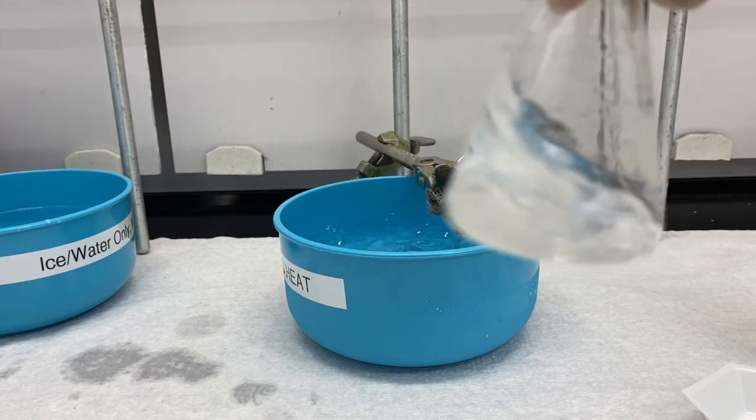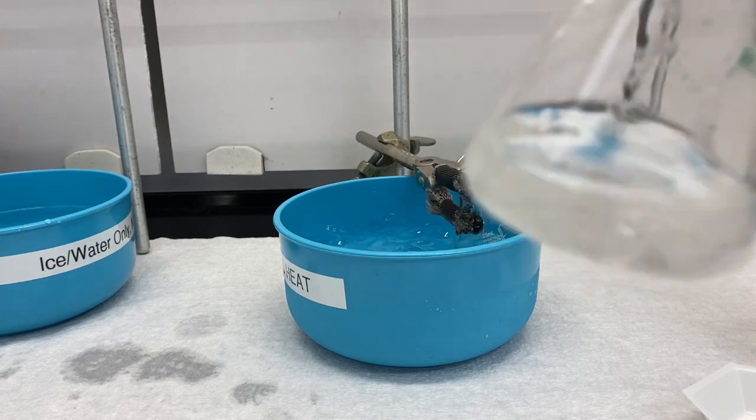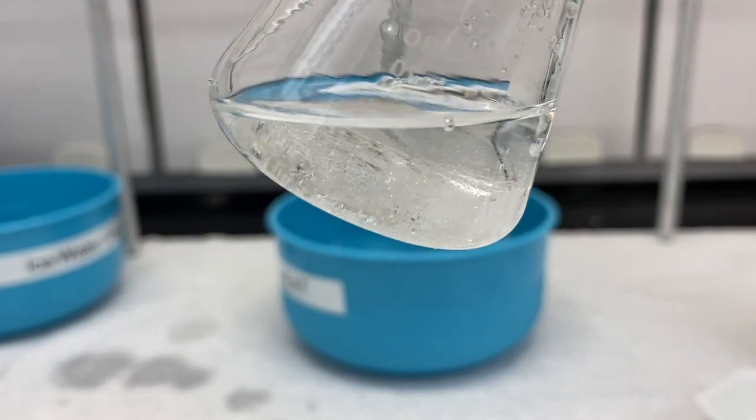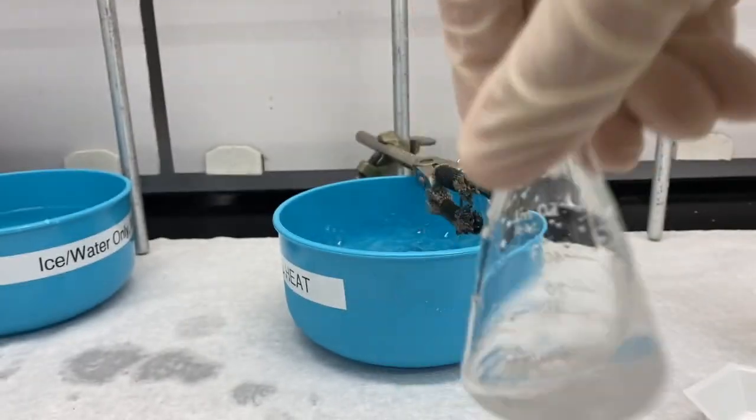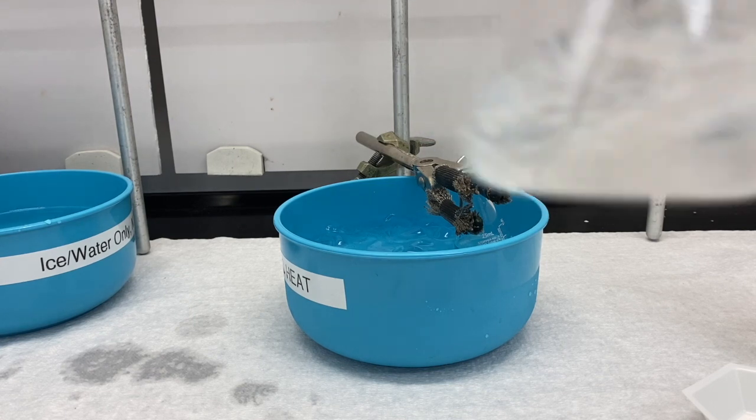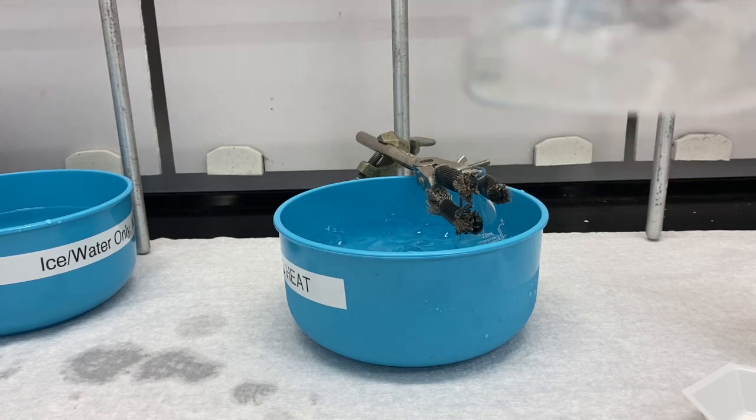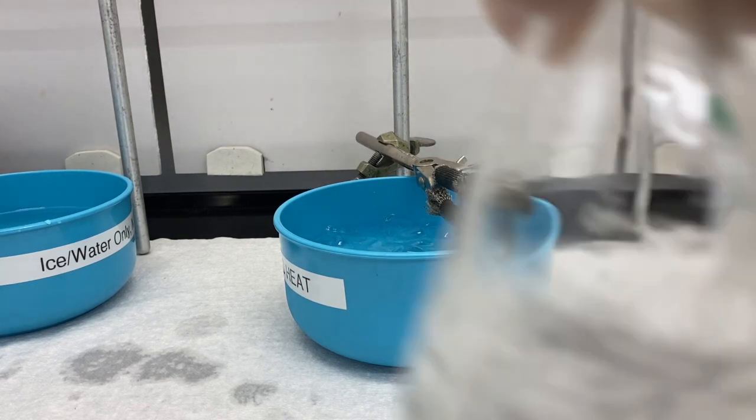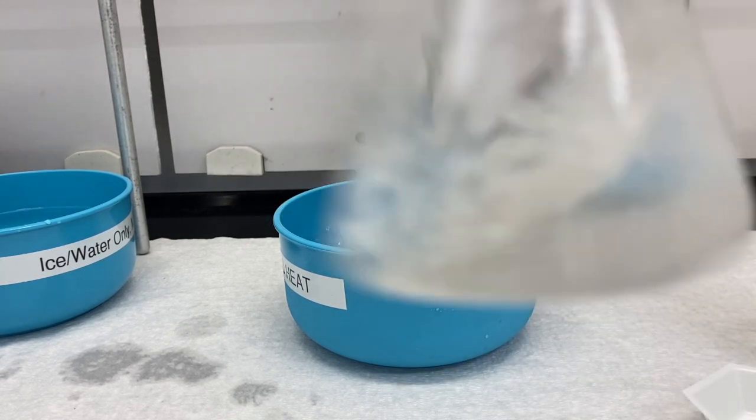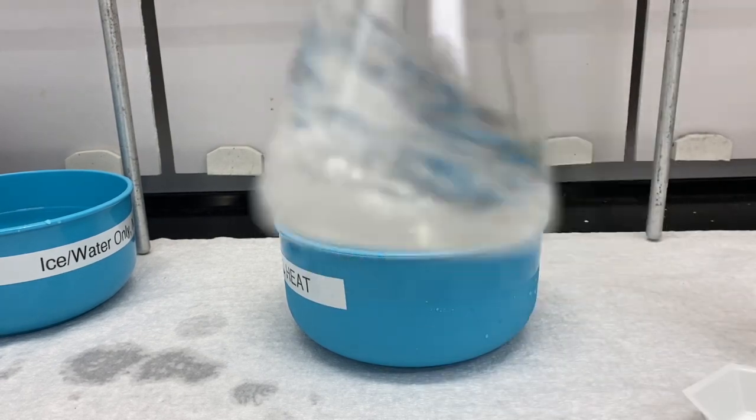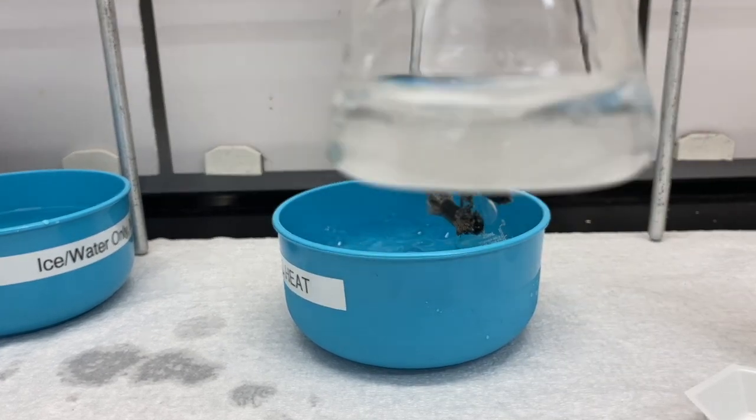All right, so I'm just going to keep swirling this until most of the solid dissolves. So we want the solid to go away so that our 1,4-dimethoxybenzene is actually in the solution so it can react. So we'll come back here in a second. Once it's all dissolved, you don't need to see me shake stuff for a few minutes.